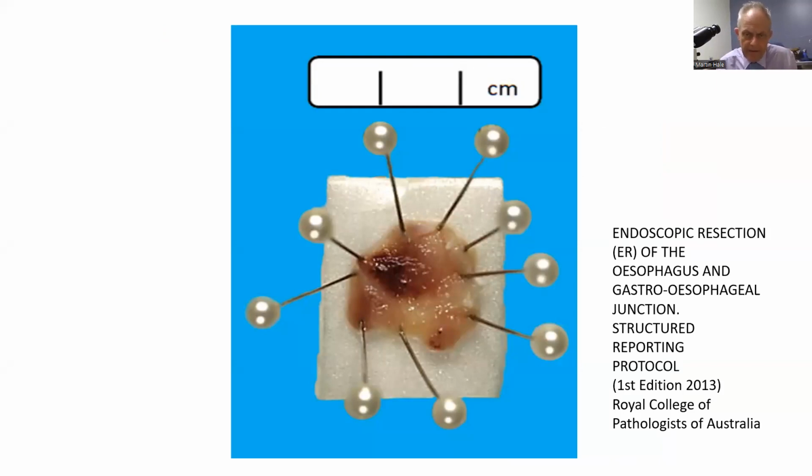And what we do is that we take the resected specimen, as Vikash showed you, and very, very important, as Vikash shows you, to pin it out onto a board. Now, by tradition, I've always used cork, and I introduced Vikash to cork. It's readily available, but you can use things such as polystyrene and so on. Doesn't really matter. It's obviously got to be resistant to formalin.